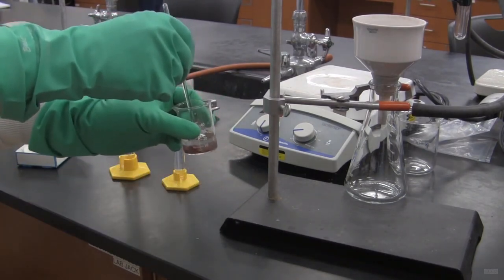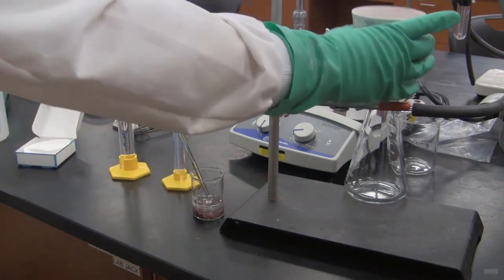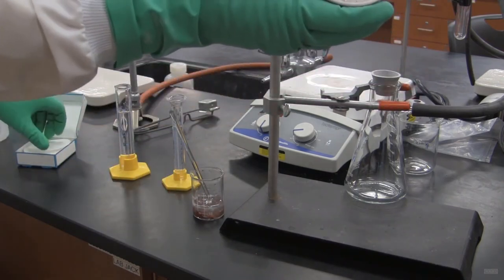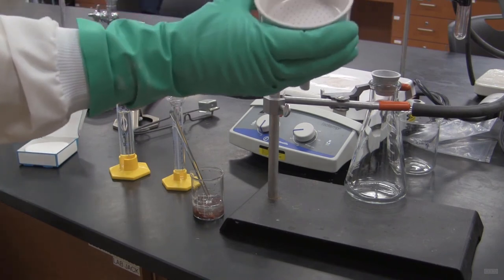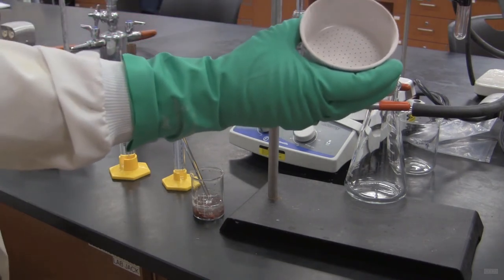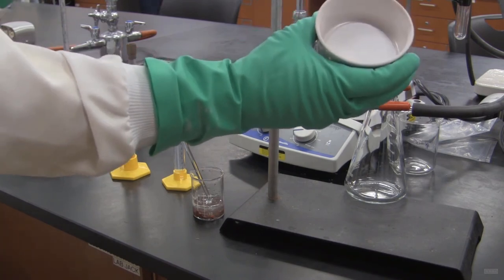So here we've got our copper, which we want to filter. And to do that, we're going to use the Buchner funnel setup. The Buchner funnel has a funnel on top and in this funnel I'm going to place a piece of filter paper. And the piece of filter paper has to fit exactly in the funnel. It goes in there like that.